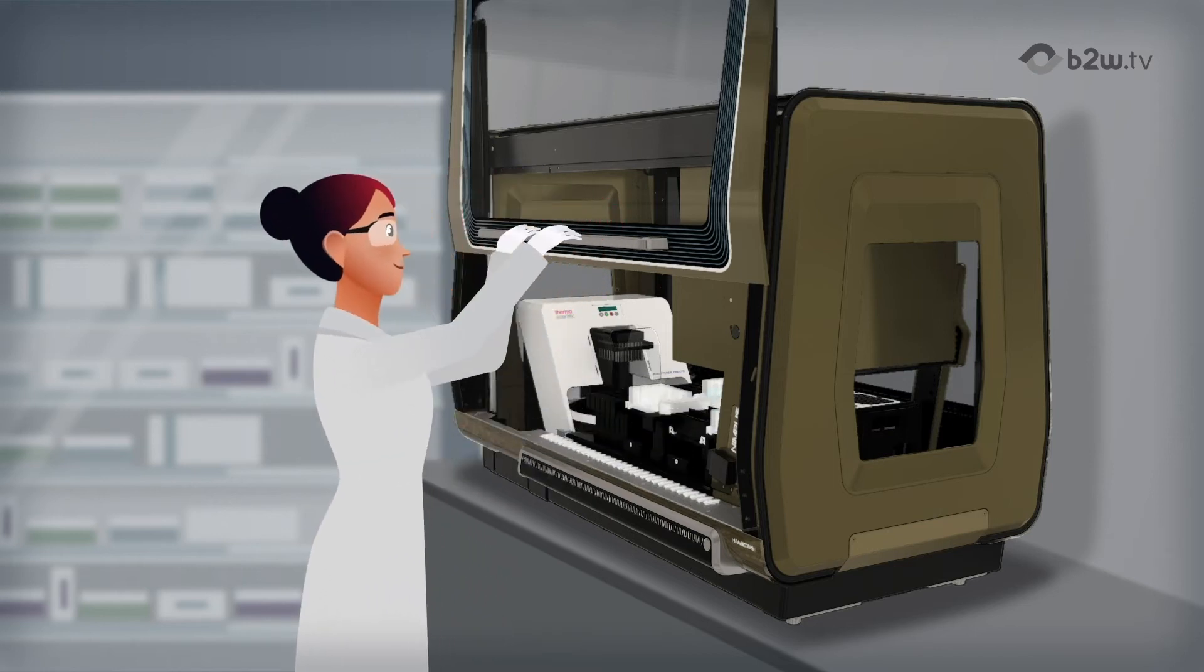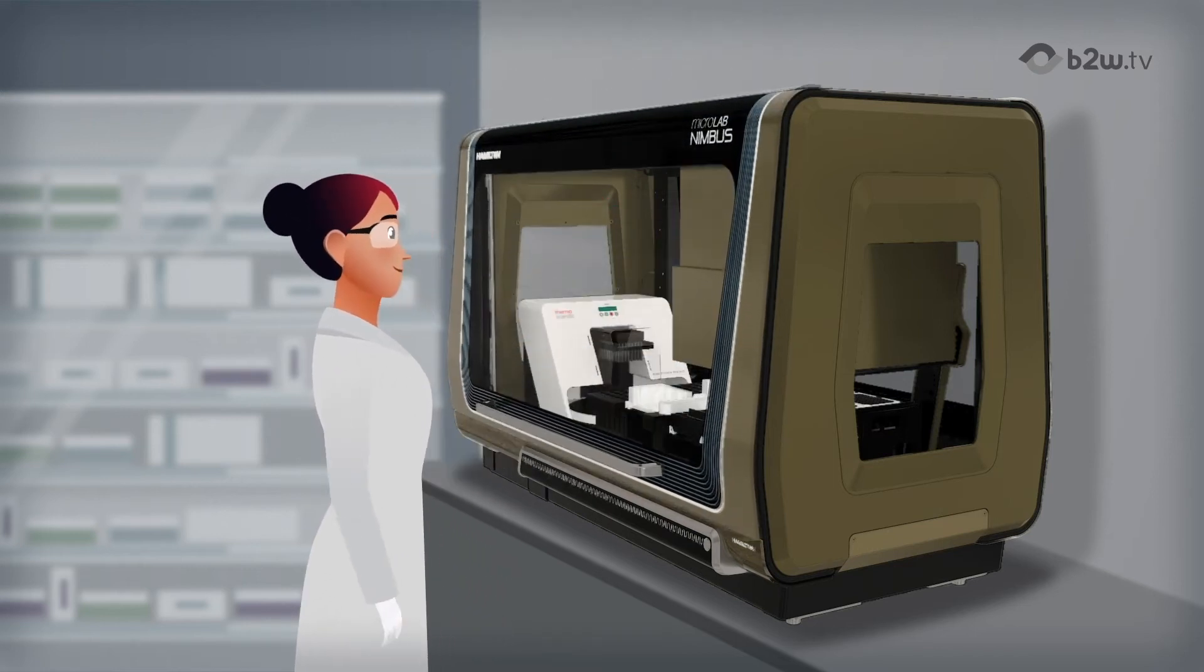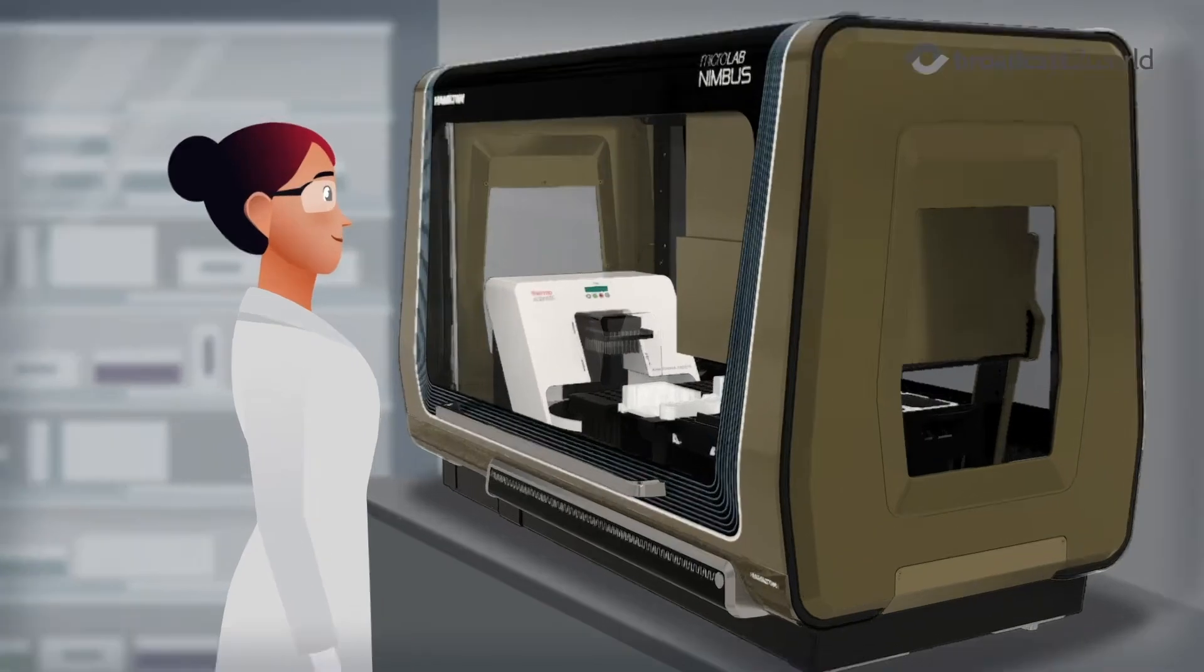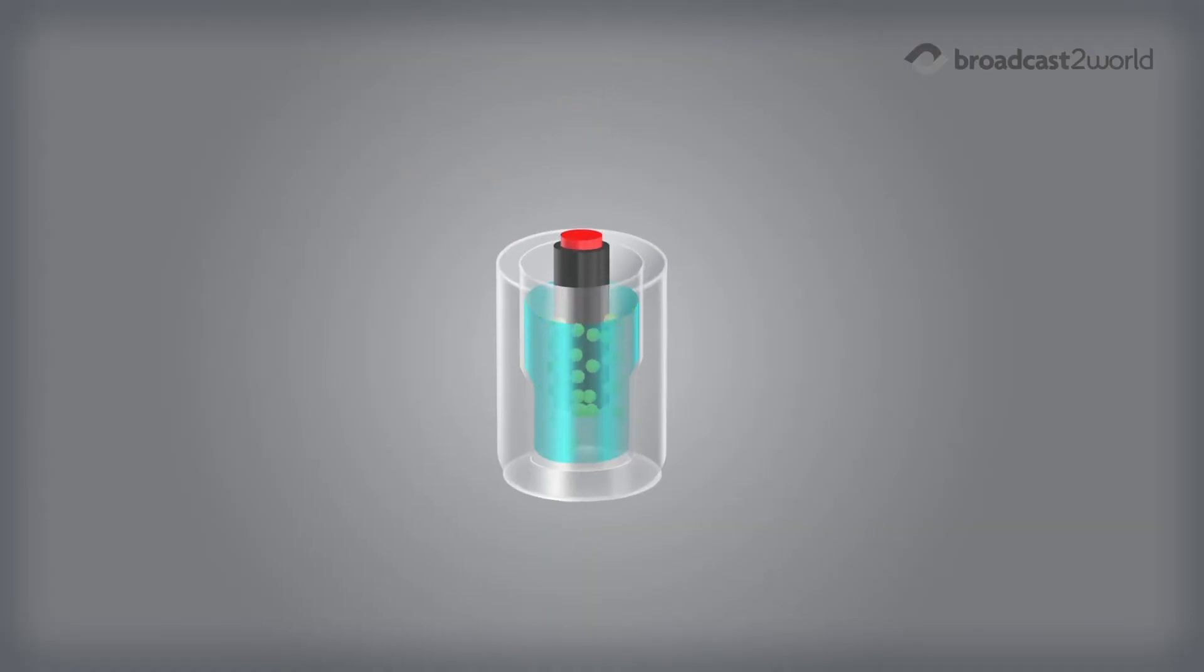Once the run starts, Prep Filer magnetic beads are added to the samples and bind to any DNA present. Cellular debris and inhibitors are then removed through particle movement purification.